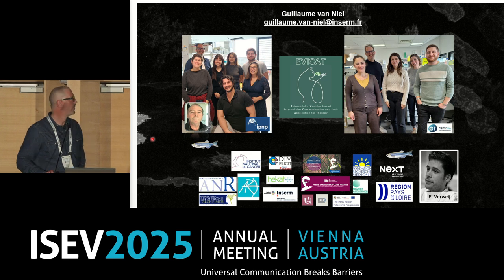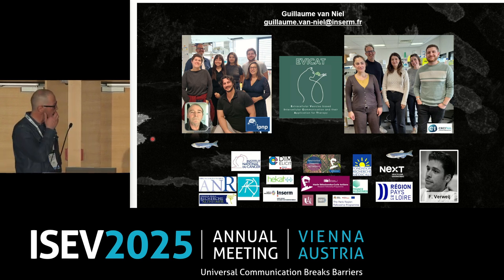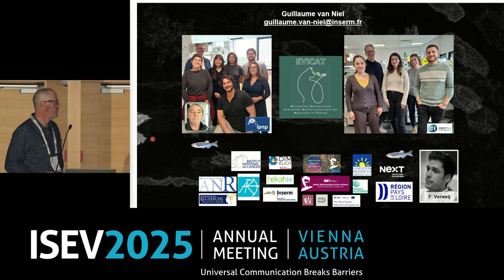Maybe I can ask a quick one. Do you ever worry about the functional integrity of the EVs after labeling? Like that the label may cause some differences in bioactivity or something else? Yeah, I'm really concerned by that, especially since my last publication. We have to be cautious, indeed, about that, and maybe it will be good to be able to correlate a function with a labeling and a biodistribution, but always keeping in mind that the labeling and the function are maybe two different things, and maybe we have different effects, indeed.